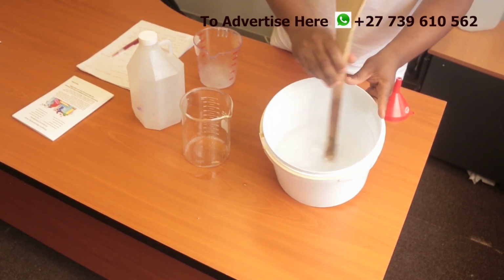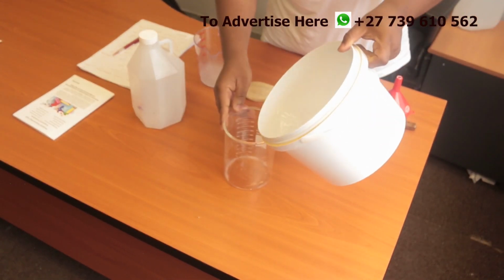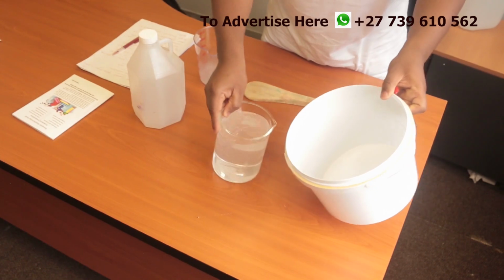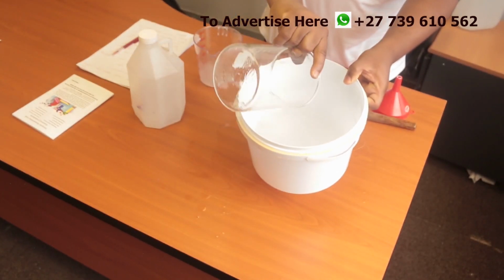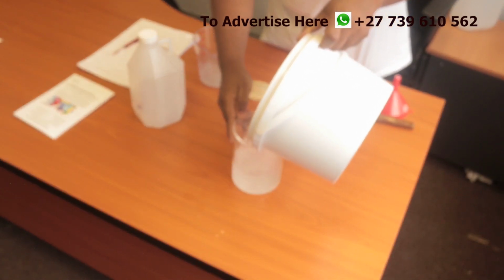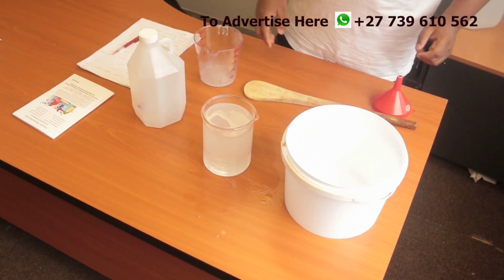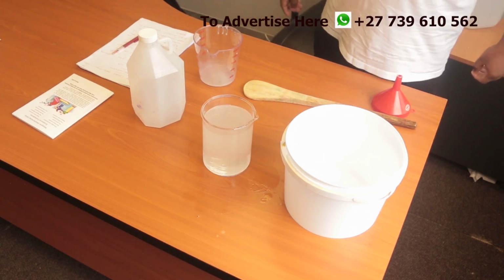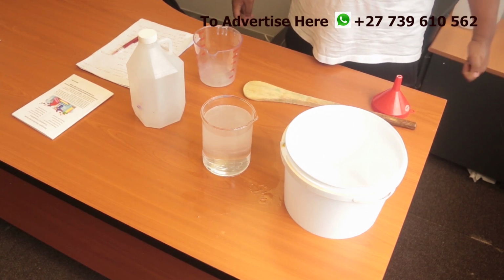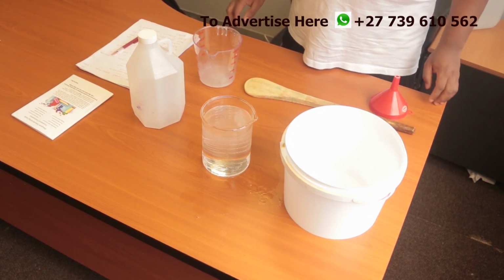If you've got a mixer, you can also use it. Just give it a little time, it will come clear. It's coming clear. Doing this, you can use your 70% isopropyl alcohol for whatever application you want to use it for.